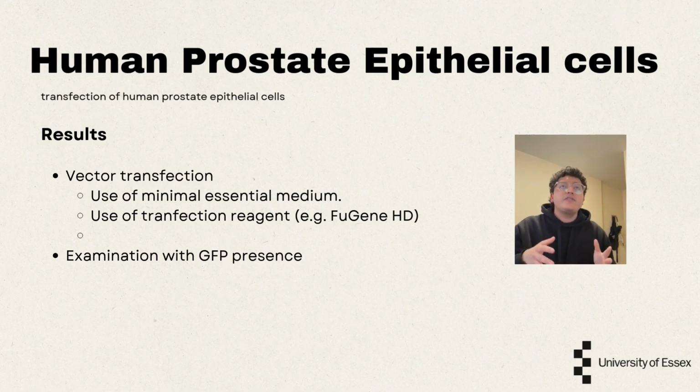And in order to know if the gene is being expressed in our cells, we have to look at the GFP, at the fluorescence of the cells. This could be done only by eye or with other techniques.